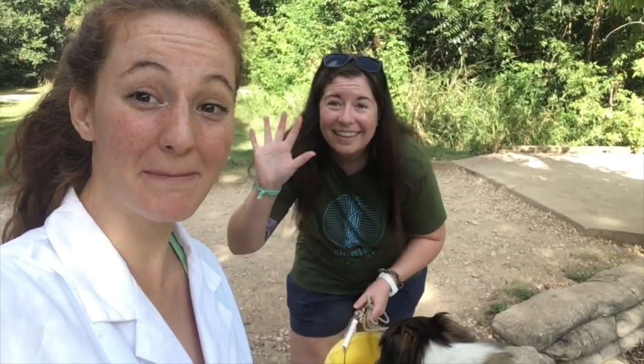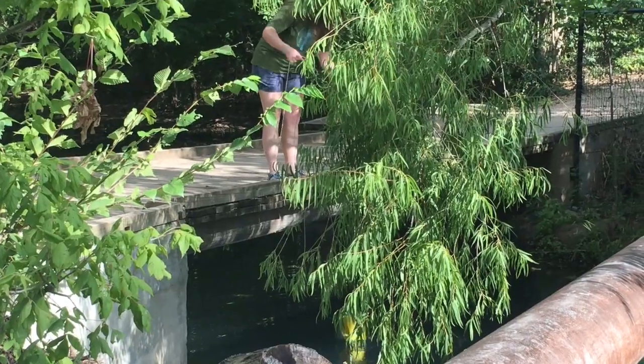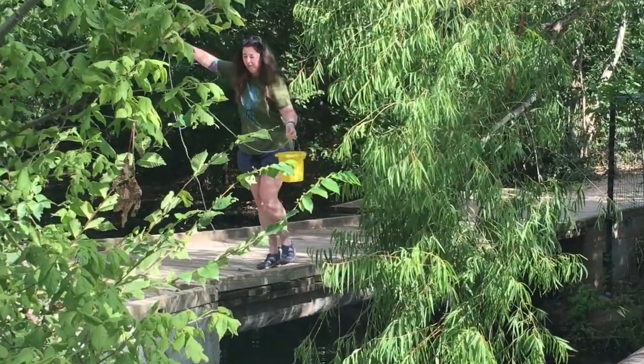Guys, we found my friend Amanda. Hi guys. She's gonna go get a bucket of water. Fancy. All right, well the test that we're gonna be performing today is dissolved oxygen. And dissolved oxygen is really important to a body of water because it really can tell you the health of the environment. And it'll also tell you what kind of animals or plants can live in the water because different animals have different oxygen requirements.